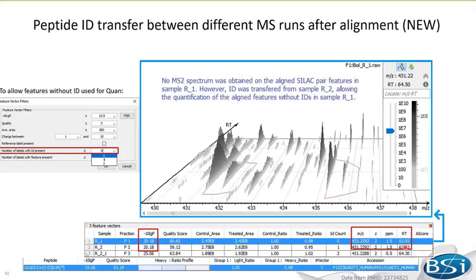You can tell from which run the ID was transferred by looking at columns such as mass over charge, charge, PPM, retention time, and the minus-10-log-p columns, since these values will be transferred from the matching run.